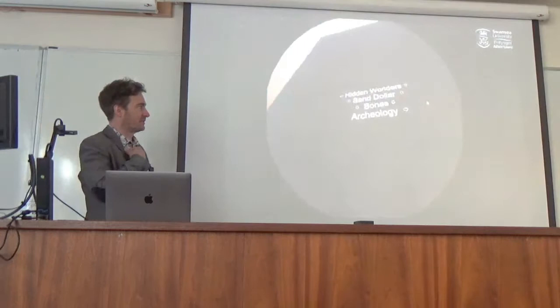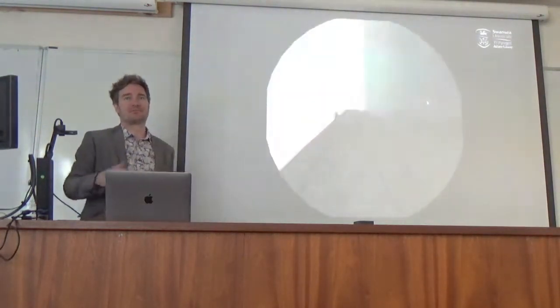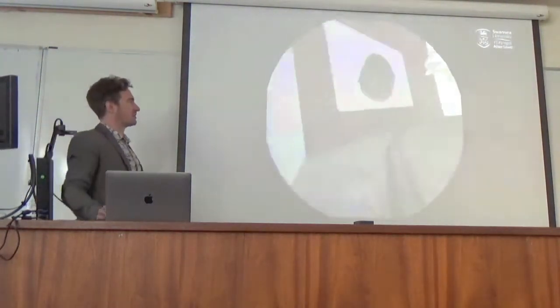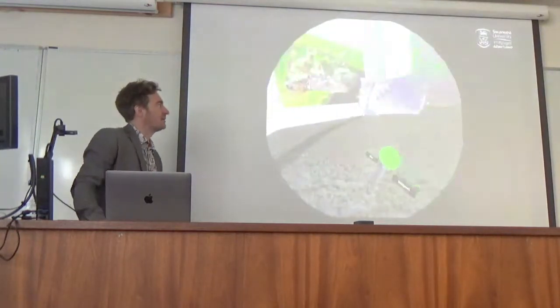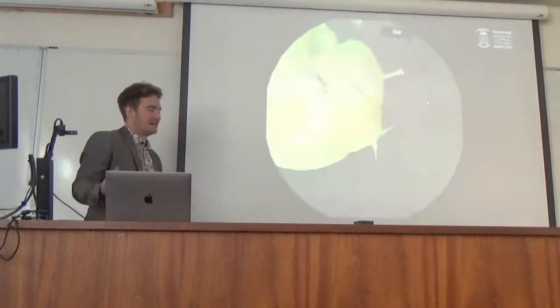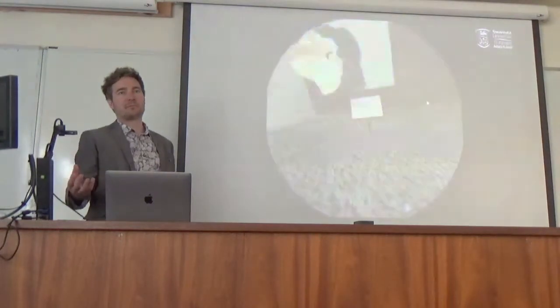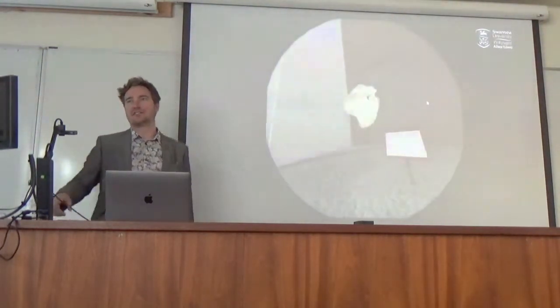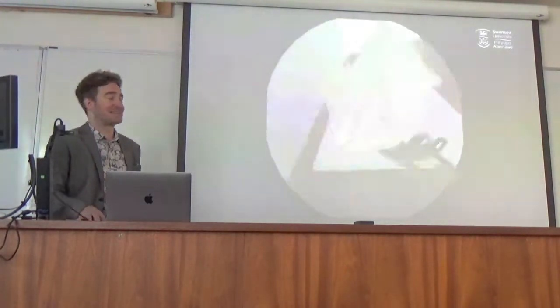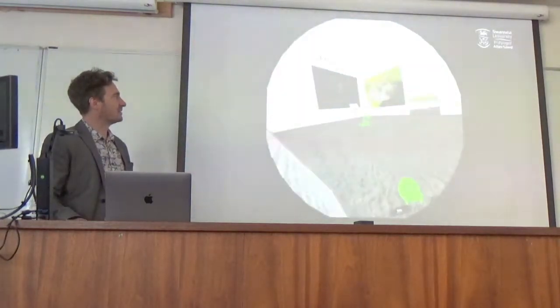And actually, when I first did that, I saw new things that I hadn't seen in the cuttlebone structure as well. So creating this output at the end of our workflow, I then saw holes and beams within that microstructure that I just wouldn't have been able to look at before. I used the analogy that a CT data set can be as big as Grand Theft Auto, the computer game. And people spend months wandering around the city in Grand Theft Auto, and it's the same with CT data. Once you get into it, you see new things, and you could spend ages wandering around and get kind of lost. Now, this is the joint of a woodlouse.